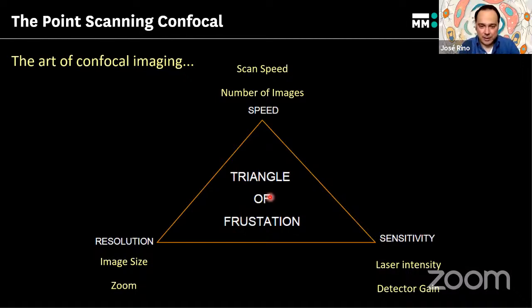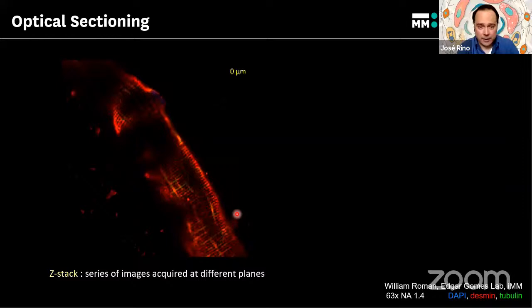It all depends on knowing how to use the system exactly for the purpose of your experiment, and that's where we are also here to help. Just talk to your local expert on what the best settings on the confocal are for acquiring an image. If you do it, they'll tell you how to do it, right? And you can get images that look like this.